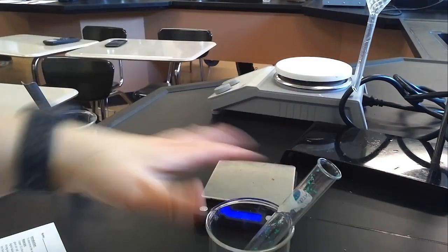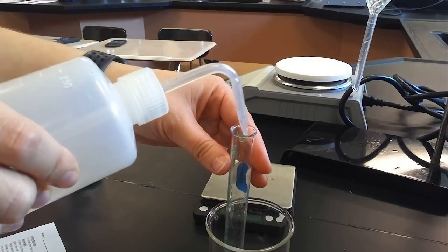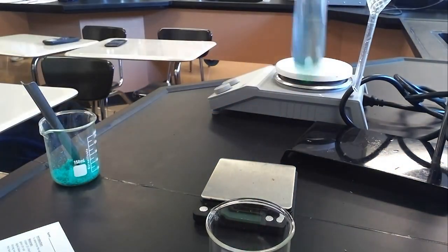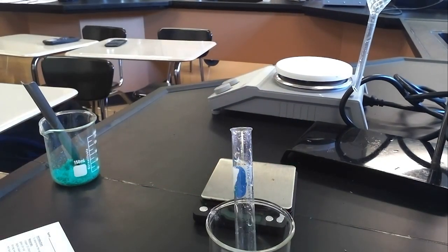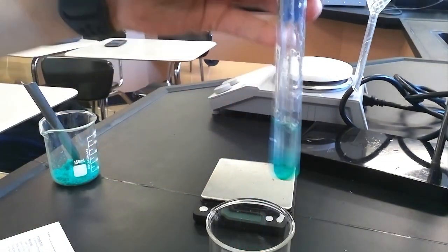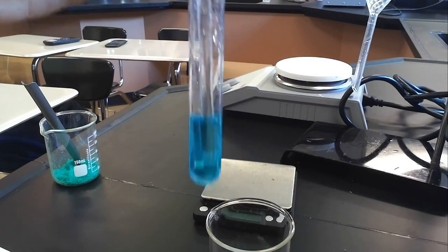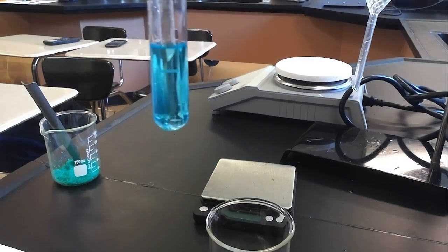I take this off the scale, turn the scale off, then use just a little bit of water from my wash bottle to dissolve the copper chloride dihydrate, making sure to get all the little crystals off the side. I use my stir rod to dissolve the solid, continuing to stir until all the solid is dissolved. At this point you can record your observations for your initial solution.